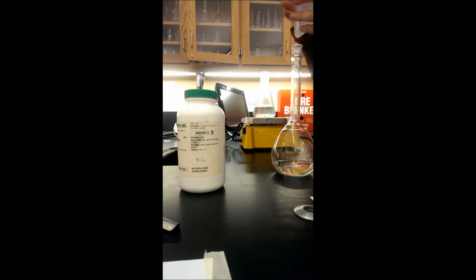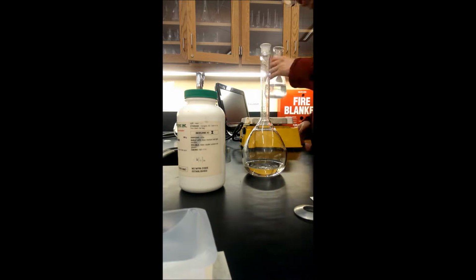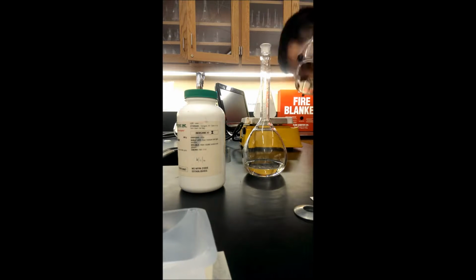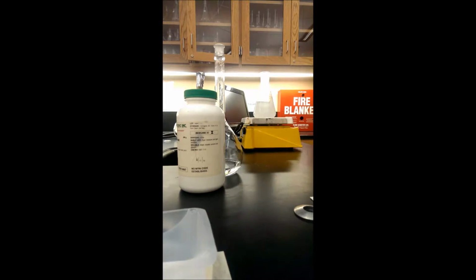And also on the hot plate there is a starch solution. It's just some 250 milliliters of distilled water and a heaping spoonful of soluble starch. Nothing special there. That is going to be the indicator for the experiment.